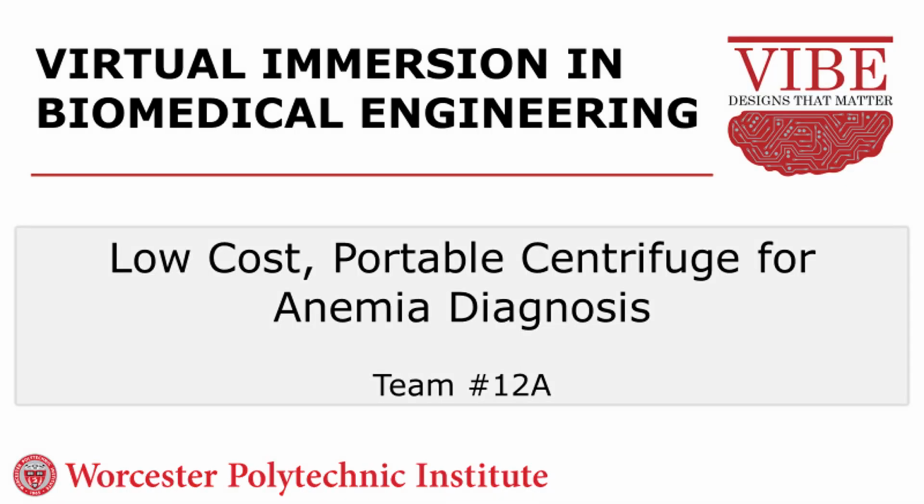Hello everyone, we are Team 12A of the WPI VIBE Program, and our project is to develop a low-cost portable centrifuge to diagnose anemia.